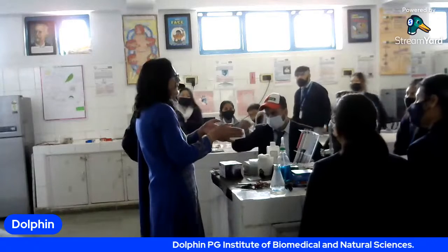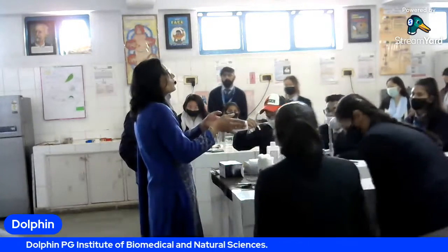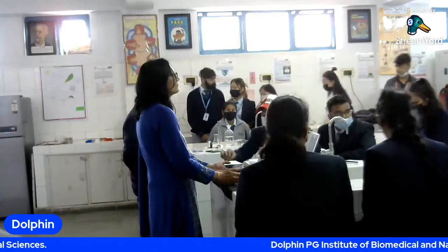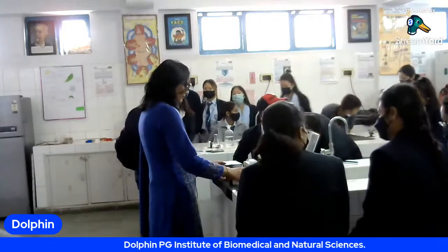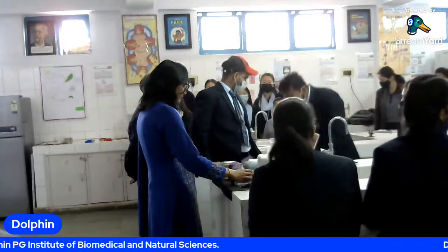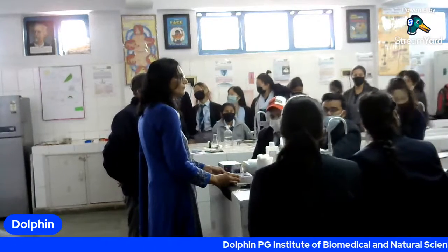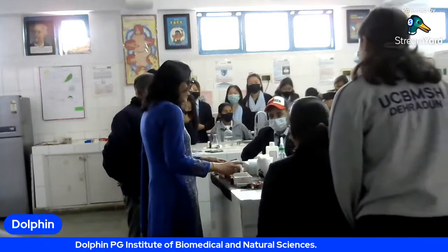This is the assembly for electrophoresis, the horizontal one.